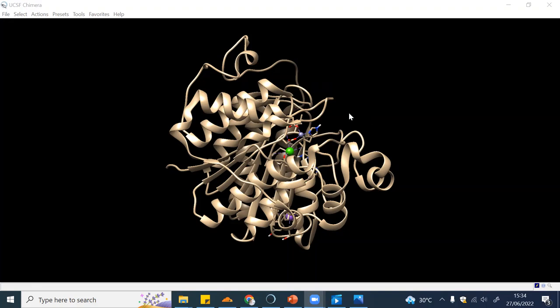In the previous video we already prepared our target protein as well as the ligand. Now we will use an online free service to dock our ligand to the target.